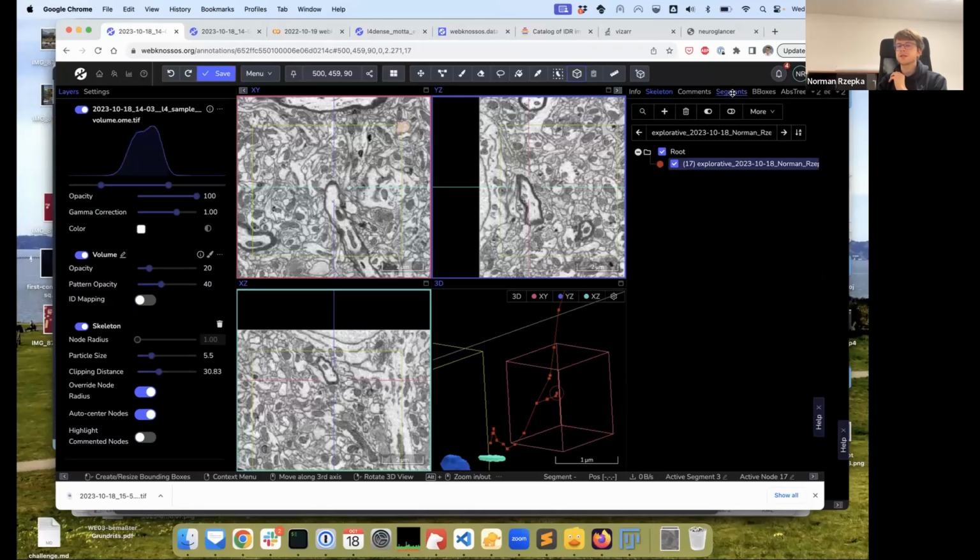So that's something that we're considering, and then naturally would also just fit to also include the bounding boxes into that. So at the moment the answer is no, we don't have a feature like that, but I'll definitely take that as feedback, and we'll see if we can put that on the development roadmap. Thanks. Any other questions or anything else that you'd like me to show?